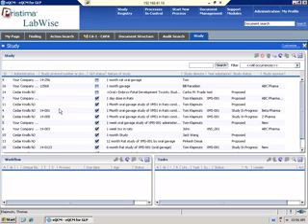The document management part of the integration with Pristema is we have SOPs. If you manage SOPs in Labwise, they're available on all of the data entry screens in Pristema. So you'll never get a notification or a 483 for the SOP not being available to the user.